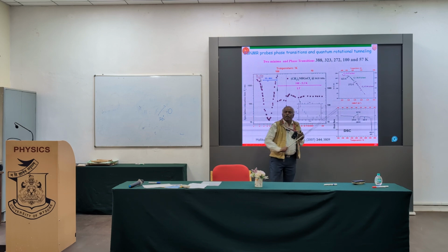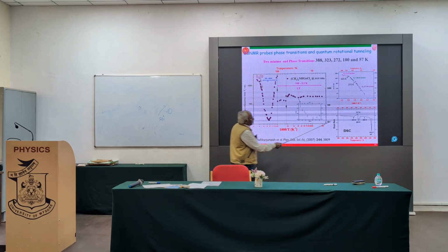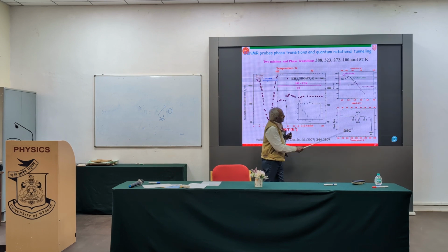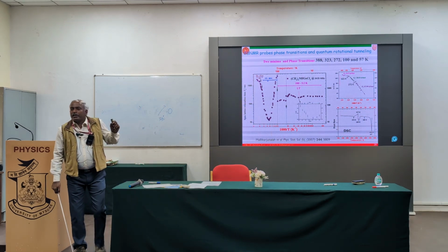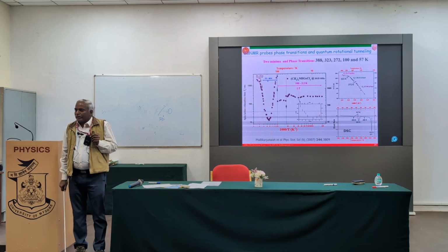These peaks represent the phase transition happening in the system. Exactly, at 272 you are able to see the change in the slope. Here 388 is beyond the limit. Between 317 and 325 the average value will be in between. At that point, 323, I am able to see the slope change. So the phase transition can be correlated with NMR and other well-established standard techniques.